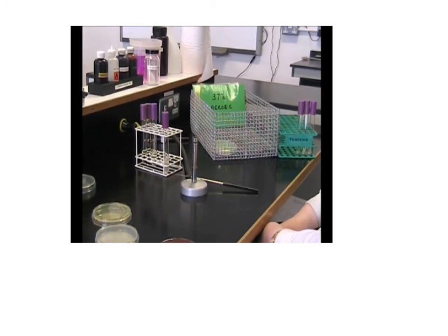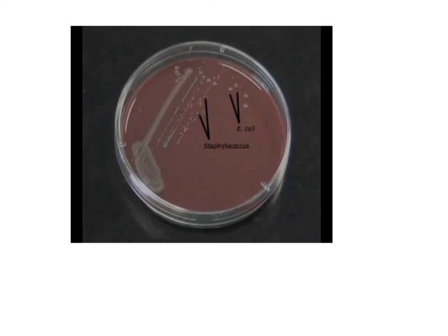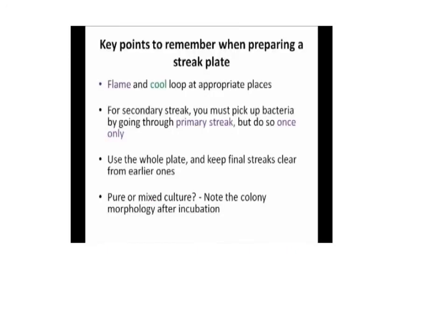Remember, your incubation conditions will define which bacteria you recover. We shall put the plates in an incubator for the required length of time. This is normally overnight at 37 degrees C for clinical and mammalian samples, and 25 degrees C for several days for environmental samples. Following incubation, you should be able to see single isolated colonies. On this chocolate blood agar plate you can see different colony morphologies. On this plate you can see the small off-white colonies of Staphylococcus and the larger smooth colonies of E. coli.